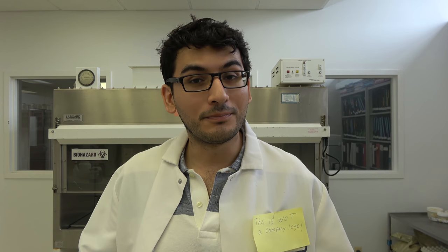And this does not have the thing in there. A lot of places have, you know, little trigger things. Looks like a little gun. You stick it on there and then you drop the liquid. We're fucking old school. We have these little plunger things. These also work just as well. You just stick it on there and then you just draw up liquid the old-fashioned way. Never under any circumstances should you blow into the pipette. I know certain people who do and those people are just called fucking old. A lot of old scientists still do this because it's just their thing. It's just a thing that we don't do anymore because it's gross and unsanitary and we know better.